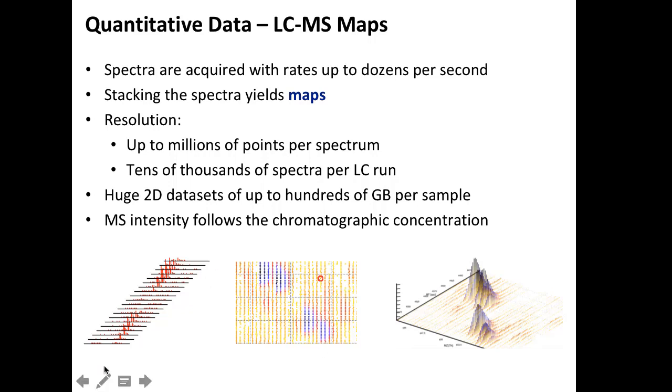So you can imagine the data as consisting of mass spectra, MS1 spectra in this case, but there is some temporal sequence to them. So if this here is elution time, then you see there are peaks coming up, then they're going down again. That's basically a peptide eluting, and here's another peptide at a different mass that is eluting. And you can represent that in different ways, either as individual spectra, just not very nice to look at, but you've all seen in top view the data, what it looks like. This here is a color-coded intensity map where you see there are things, whatever they are here. And you can also look at this 3D view where you see stuff coming up, then going down, and you also see the isotope profiles that are attached to that.